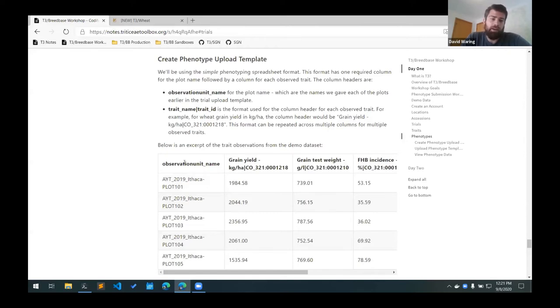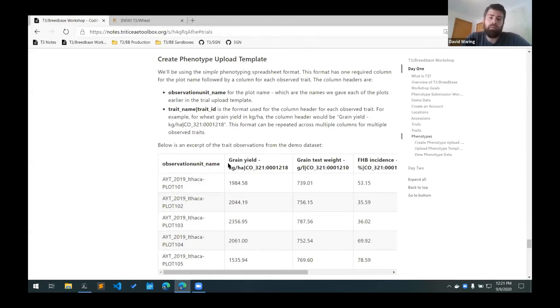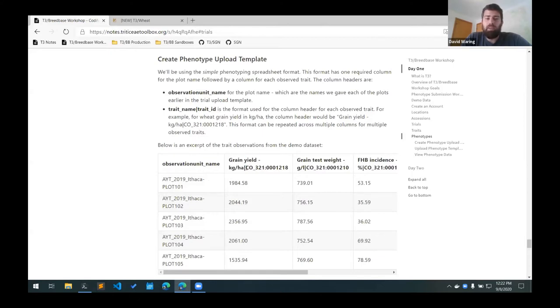So we have that column with all of the plot names and then we have a column for each of the traits that we observed. The format for that column is going to be the trait name followed by a vertical pipe and the trait ID.